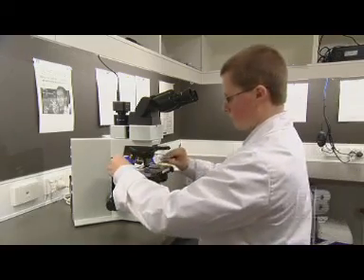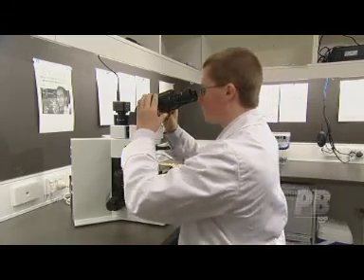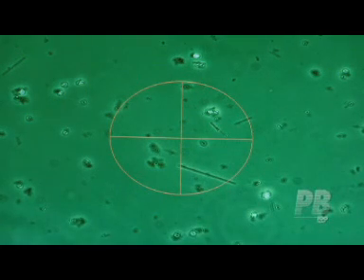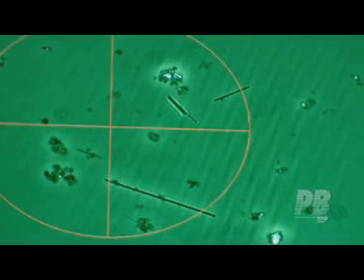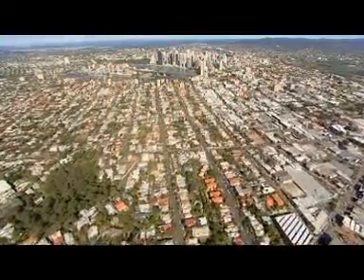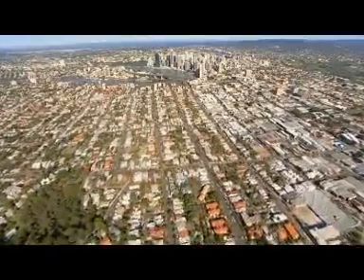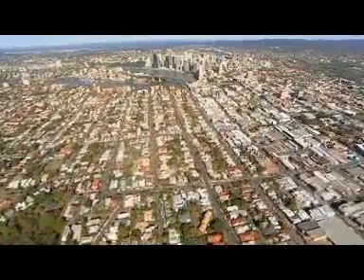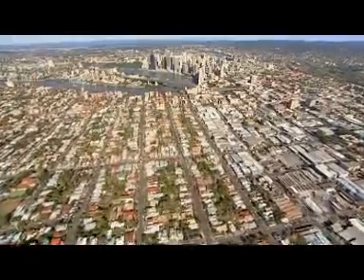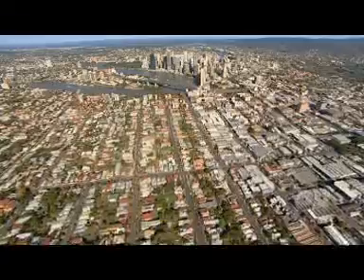The report is expressed in 2 parts. 1. As fibres per 100 fields of view. A field is a known area of the filter which is examined for fibres. And 2. As fibres per millilitre of air. A normal background count could have up to 10 fibres per 100 fields. The current occupational exposure standard for asbestos in Australia is 0.1 fibres per millilitre of air.